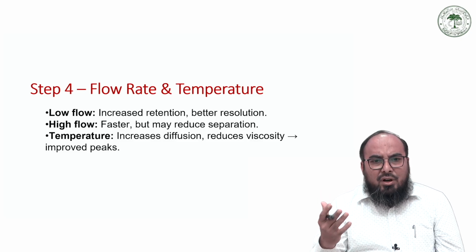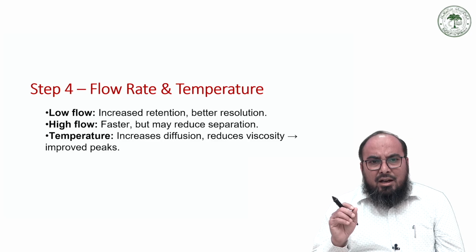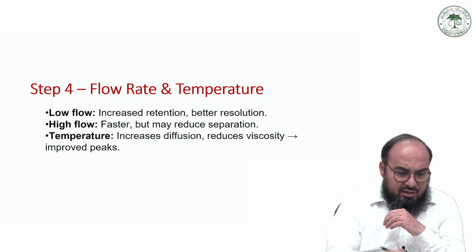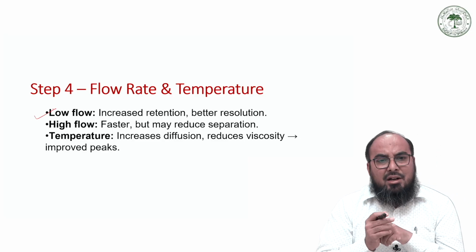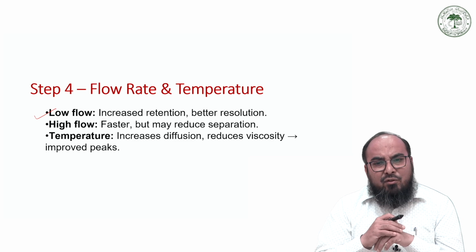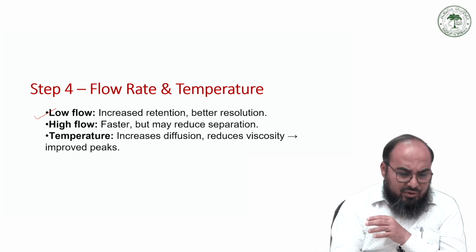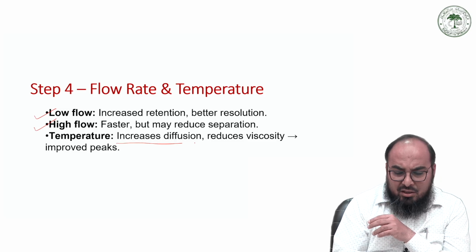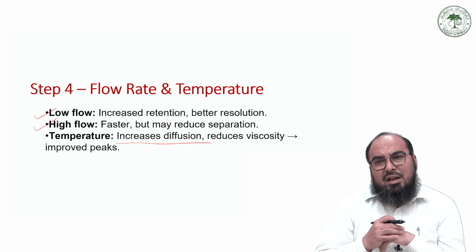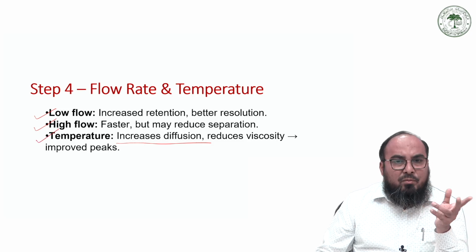Flow rate should have an optimum value, and it should be towards the higher side. A low flow rate increases the retention, and of course resolution is good, but a high flow rate sometimes reduces separation. And the temperature, we have already discussed the effect of temperature in terms of diffusion, and it also reduces the viscosity, and of course it leads to good separable peaks or improved peaks.